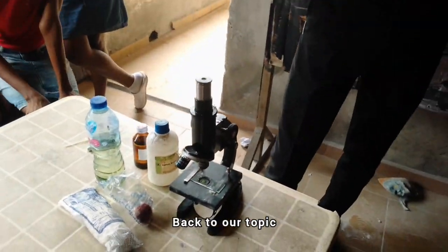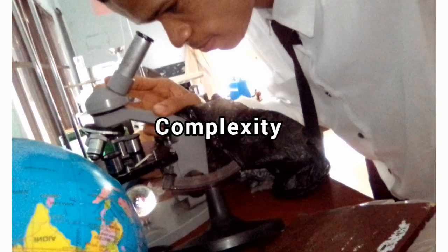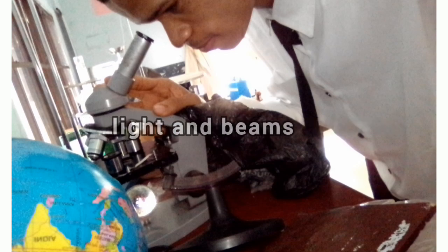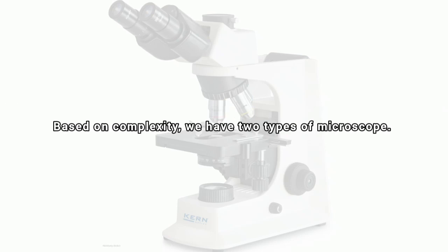Back to our topic. Let's look at the types of microscopes we have based on the following criteria: complexity, number of ocular or eyepiece lens, light, and beams. You must also know that some microscopes are a combination of some of these criteria. Based on complexity, we have two types of microscope: the simple microscope and the compound microscope.